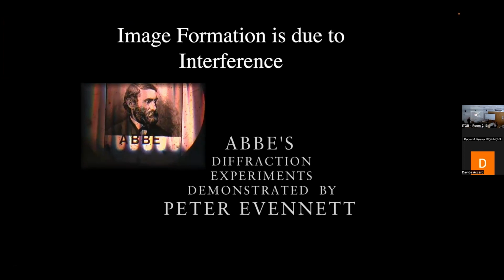We observe one wavelength, or a really small window of wavelengths, at a time, and we have our fluorophores in green, in red, in blue, and so on. But remember, a longer wavelength means a larger minimum resolvable distance, because the diffraction is actually larger, while a shorter wavelength has a smaller diffraction pattern, and you will have higher resolving power. So you can do it with monochromatic light, but you need to use the shorter wavelengths. And the visible is limited to about 400 nanometers. You cannot go much shorter than that.